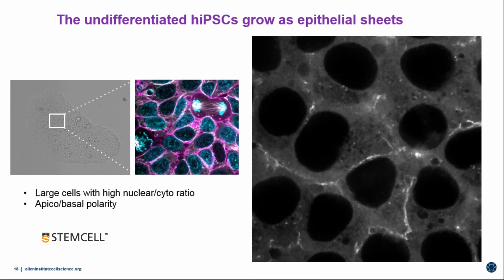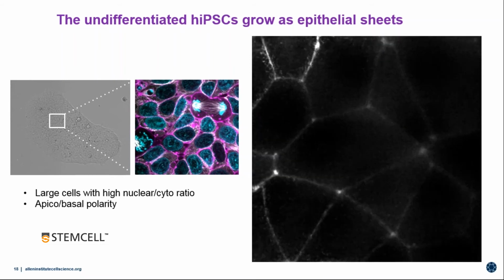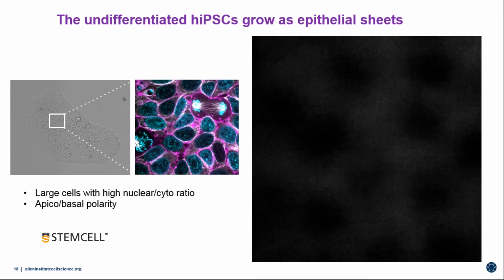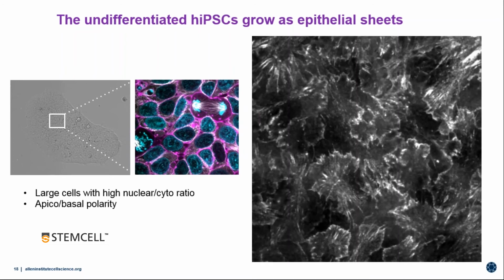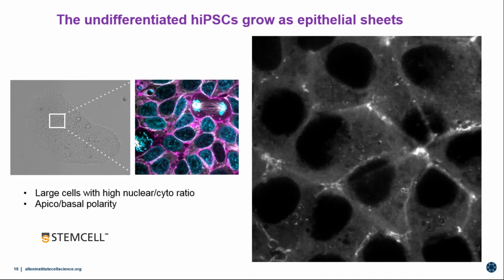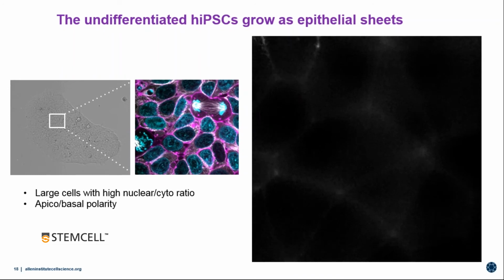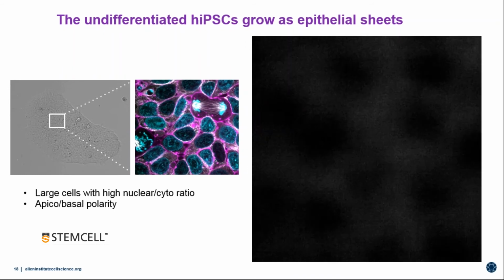Stress fibers, you can see the black holes, the nuclei, and the cortical actin. So this was one of the first ones we imaged, and we were still amazed. This is not overexpression. This is endogenous actin expressed from the cells. And you really don't need super resolution or any kind of really high end.